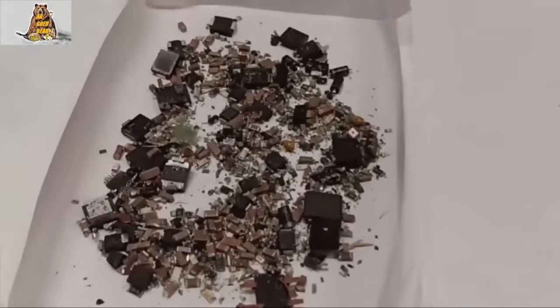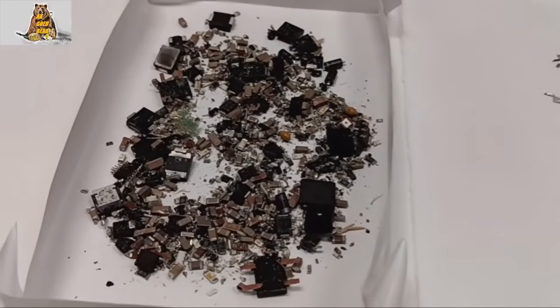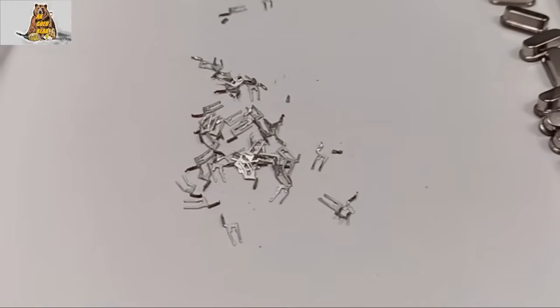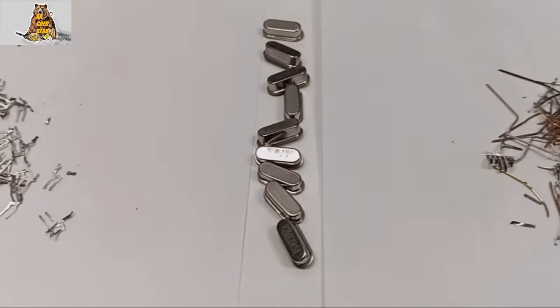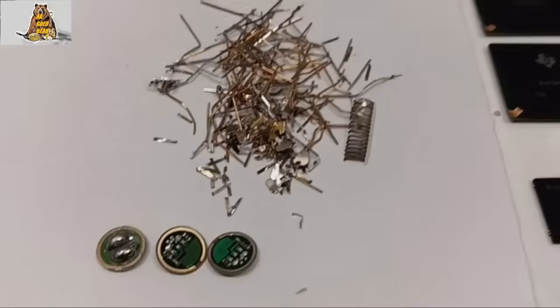I collected all small MLCC capacitors, 99% sure they are empty. SMD resistors with silver and transistors with gold. I hope there is silver plating here. Crystal oscillators with silver. Gold plated wires from phone jacks.